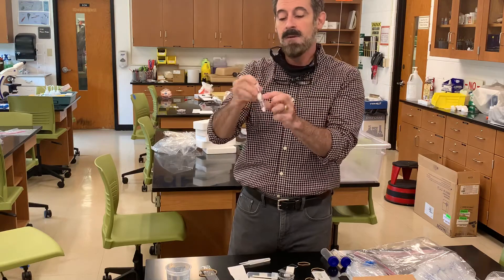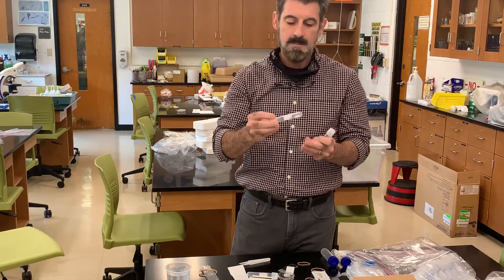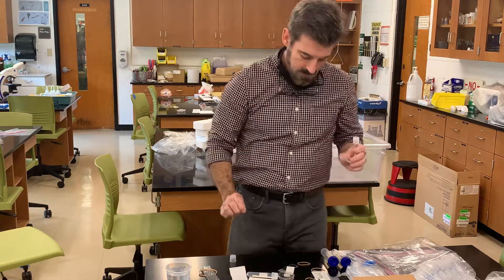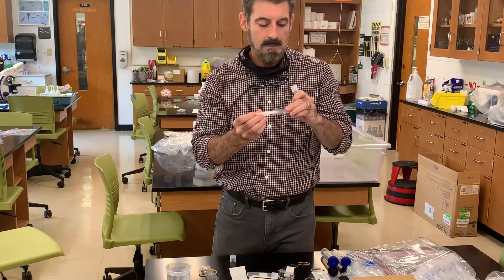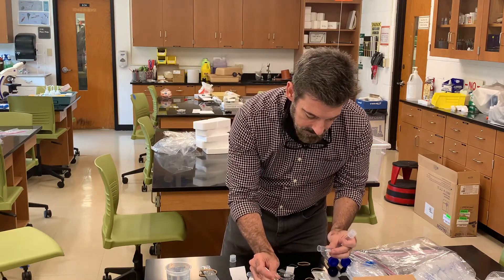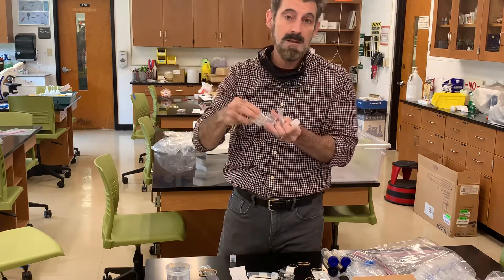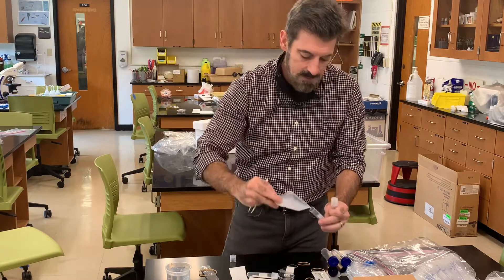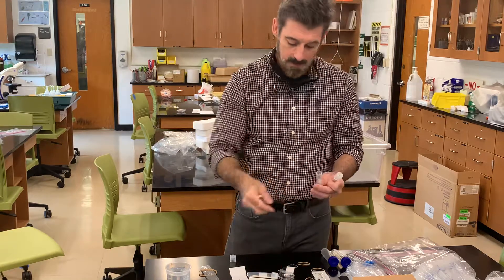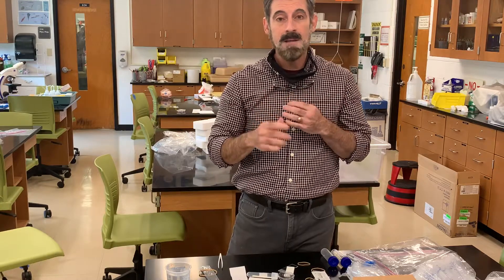One of these tubes will be labeled 'filter paper disks' — it's just a storage container. Inside are tiny little filter paper disks that you should never handle with your hands; you'd only handle them with a pair of forceps, grabbing them carefully. You could dump them out into your weigh boat if needed, then pick them up with the forceps and place them into containers with different concentrations of enzyme during the enzyme lab. Anything unused can go back into the kit. The weigh boat, pipettes, and forceps are multi-purpose, but the filter paper disks are pretty much just for the enzyme lab.